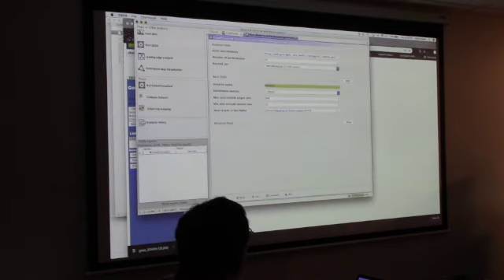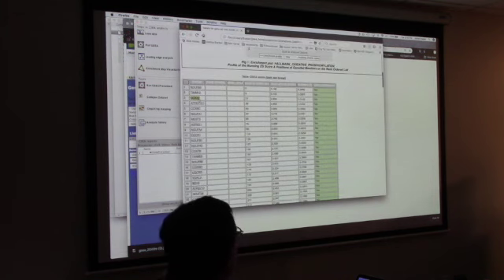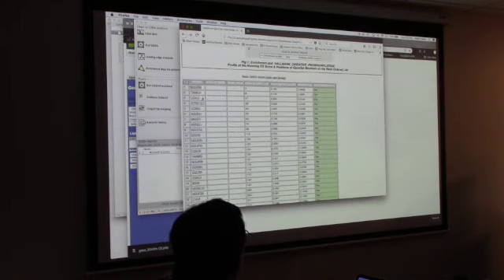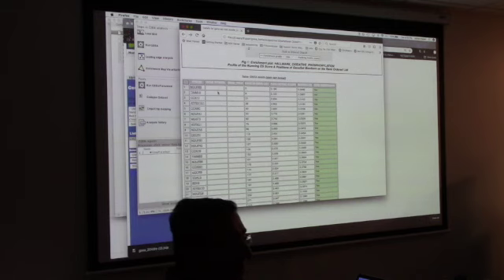Okay. So you can go from here and go down this and figure out, like, why is COX17 rank number 21? What does this gene do? This takes you to AFI, which is a mistake, but you kind of get the idea. You can go ahead and look this gene symbol up on your website or wherever you want. Do a Google search and find out what this gene does. Right?